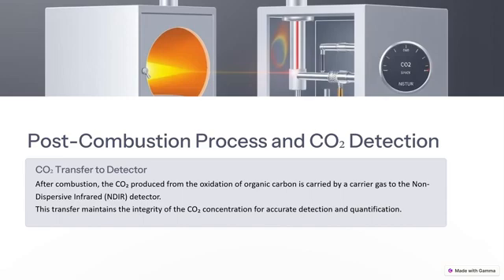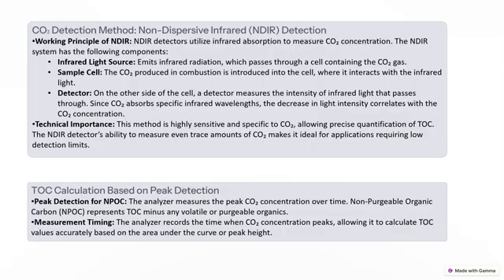In step 2 of the analysis, we have non-dispersive infrared detection, which is called NDIR. The most common detection system in TOC analyzers is the NDIR detector.